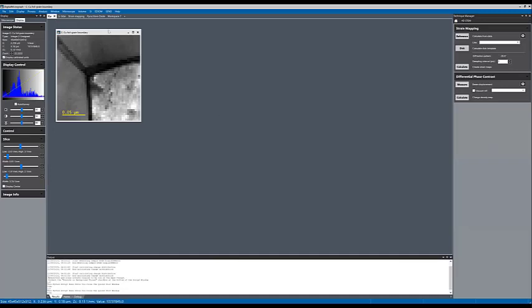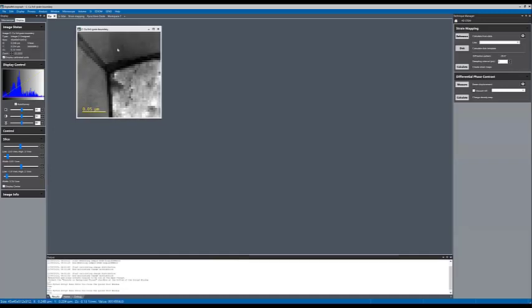The first example that I'm going to start with is this 4D STEM data set on a copper foil grain boundary. This is a copper sample, just a planar sample that we thinned in a PIPS, put in a microscope, and collected the 4D STEM data with. You can see this is a 4-dimensional data set. I have 45 by 45 by 512 by 512 pixels.